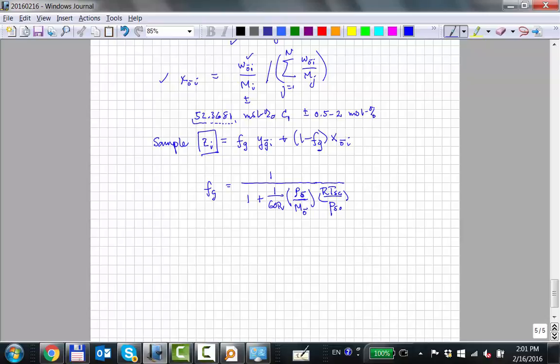That's probably the uncertainty in reality. And for methane, and also for the total C7 and heavier, it's probably that. Overall, the total is probably not more accurate than that.